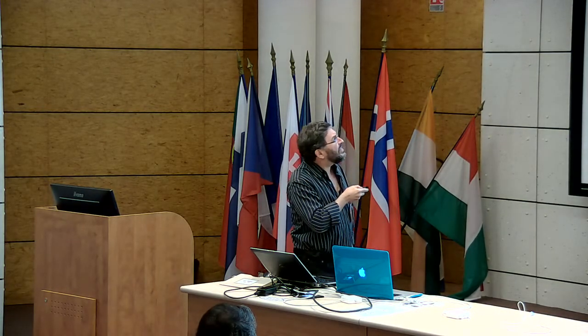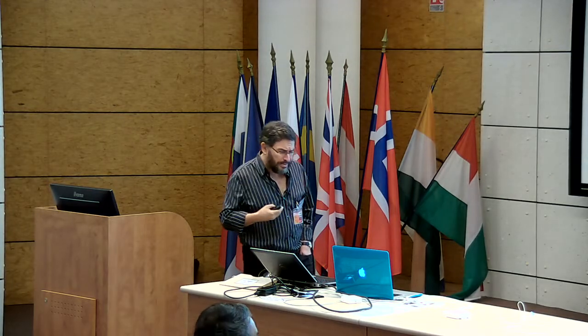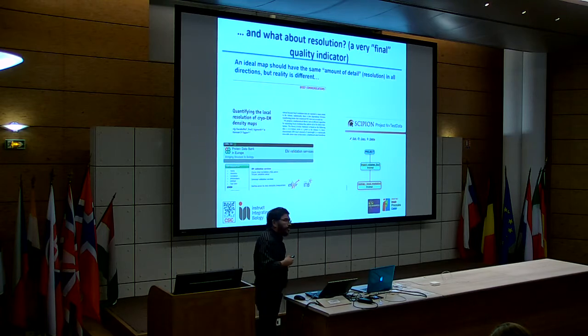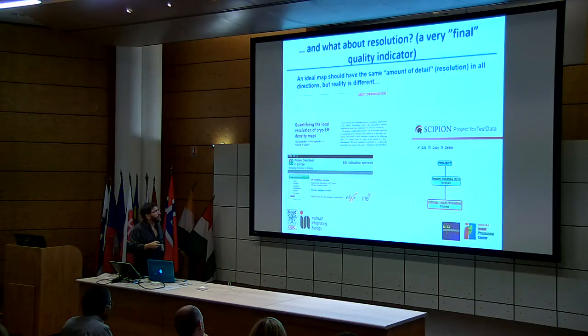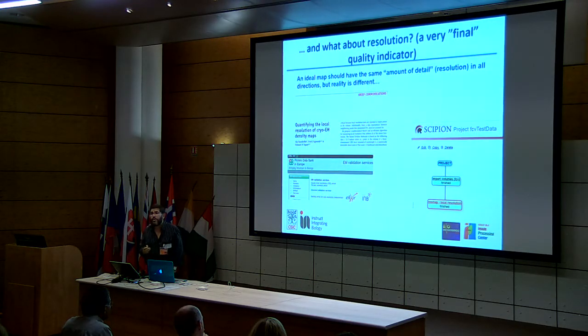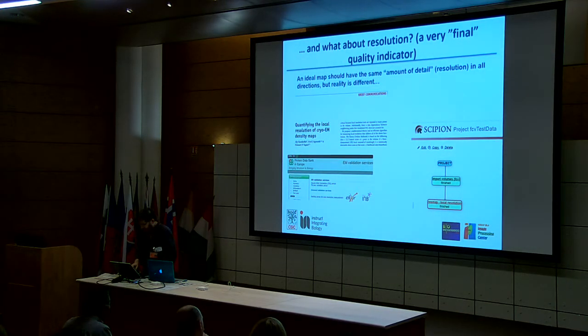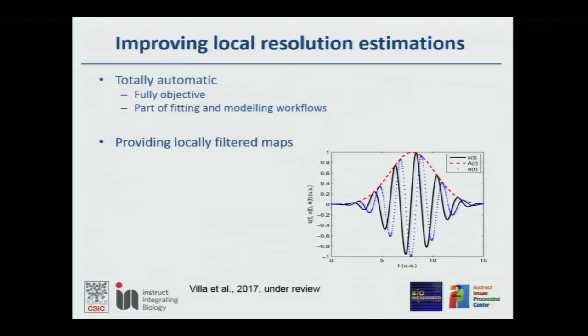Our contribution at this first stage was making things accessible, from a resource and infrastructure point of view. Now, if you go to the EMDB, the electron microscopy part of the PDB, and go through the validation resources, you get the ResMap server that points to our server in Madrid, and it gives you a very simple workflow where you can upload your map and immediately get your local resolution measure. Can we do better? Yes, of course, because a few years after ResMap, we can do better.